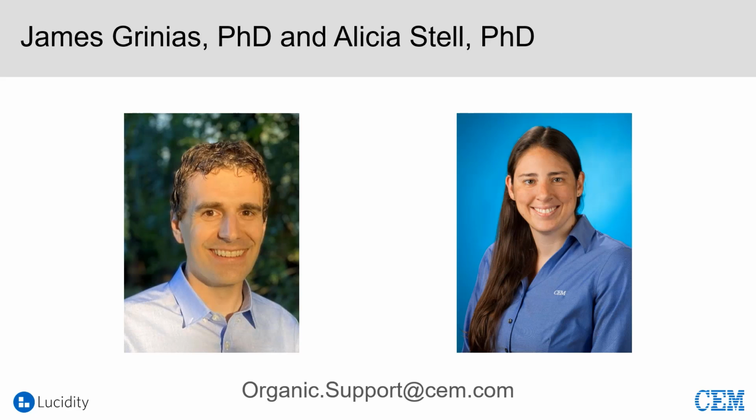So yeah, I mean, Jim was right on the point of everything that he was talking about there, but just kind of from a very basic level, with a smaller system, you first gain, it's small, it's not very heavy, so it's movable, right? I wouldn't necessarily say portable. You're not going to bring it into the field, but you could easily say put it on a cart and move it from lab to lab. Jim even talked about the robustness and kind of saying, okay, different systems in different labs, but think about robustness of bringing one system to possibly different labs within a hallway or a building or so forth.